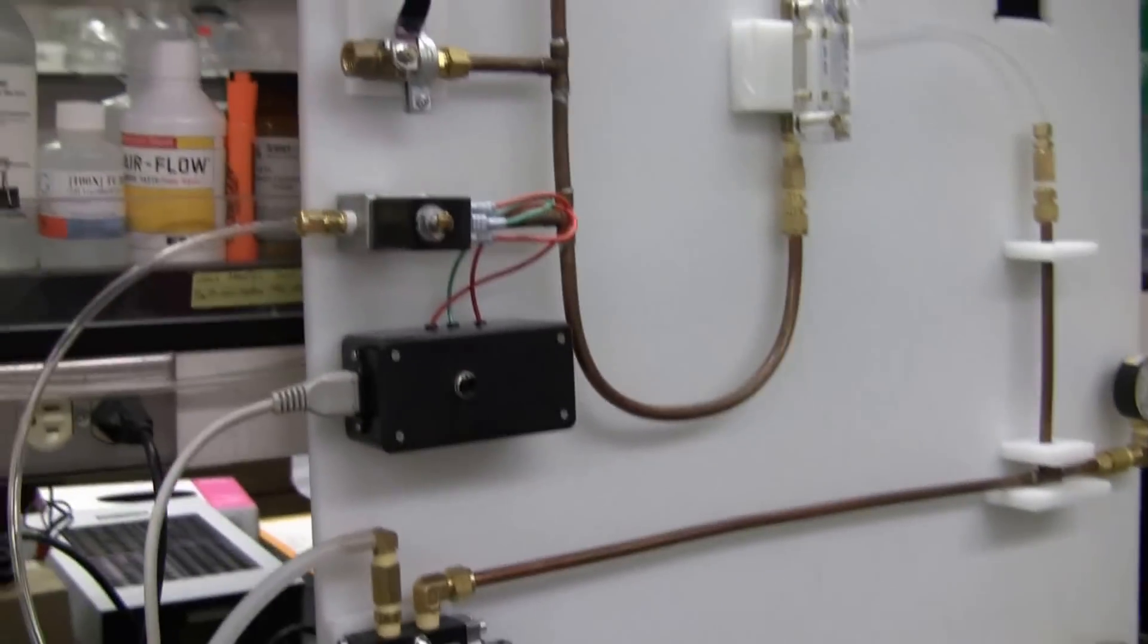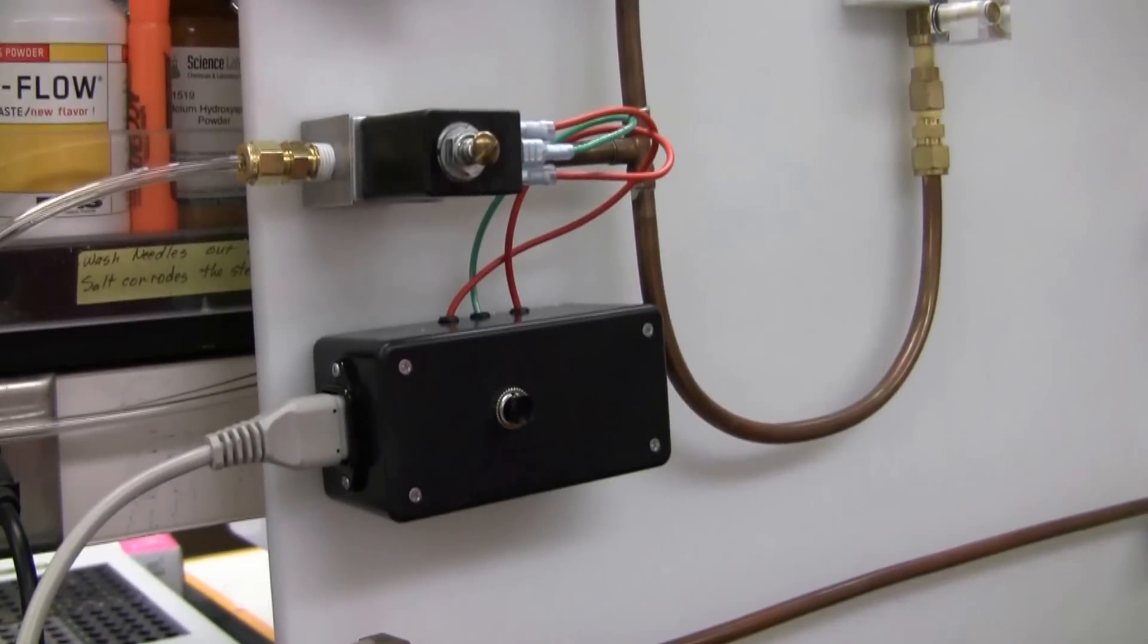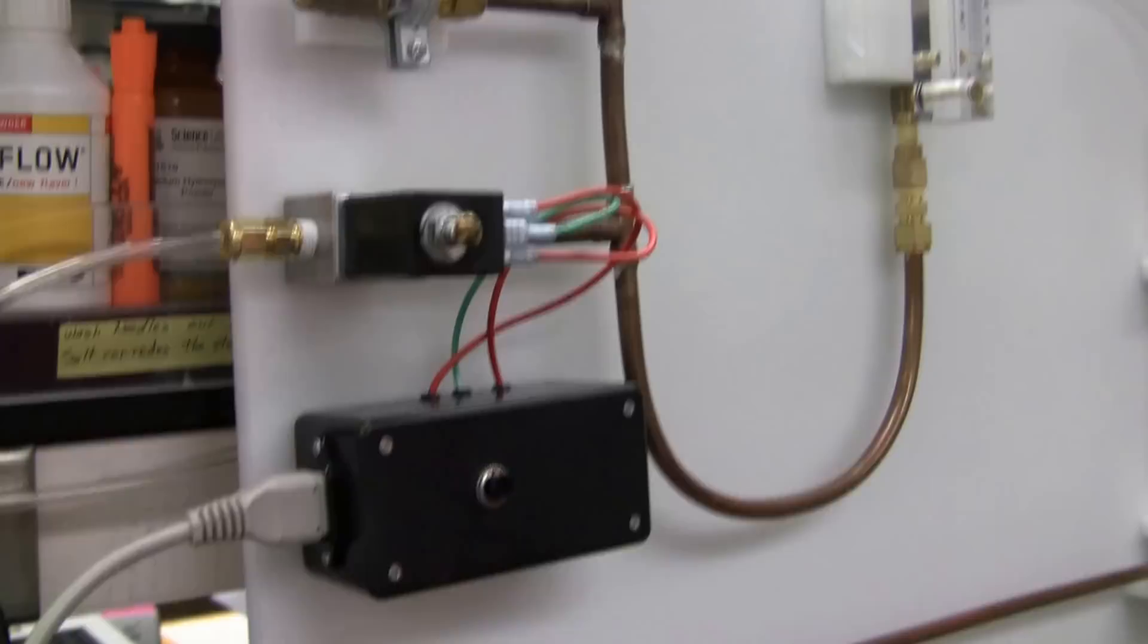Finally, there is a feature that we're very proud of. It's a so-called dead man switch.